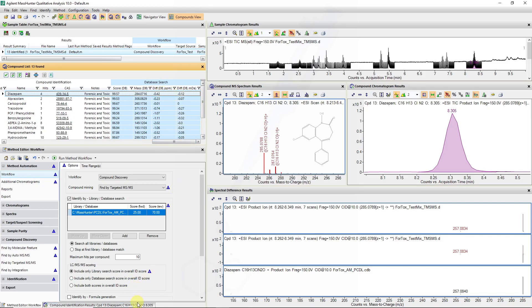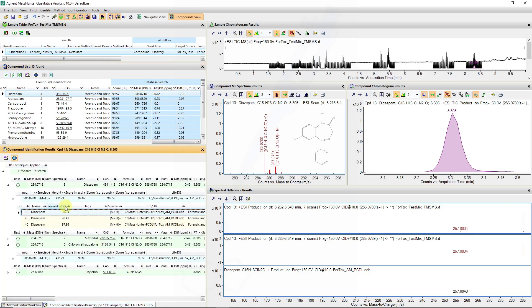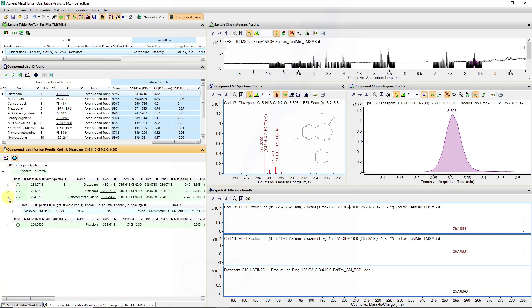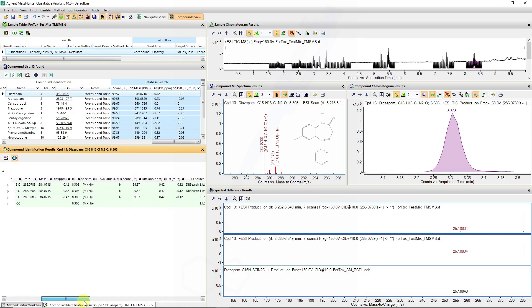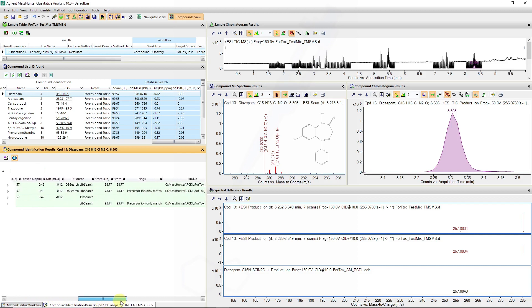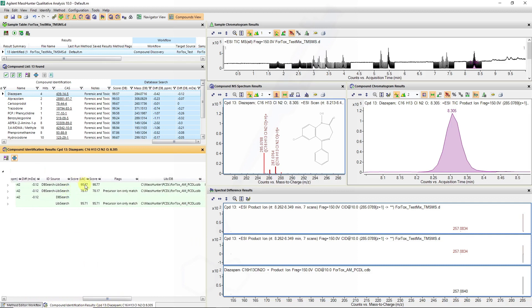So bringing up the results we can see that again from our database three isomeric species and one isobar was identified, and in this case diazepam is ranked and listed as the one with the best score and we can look at the reason why.